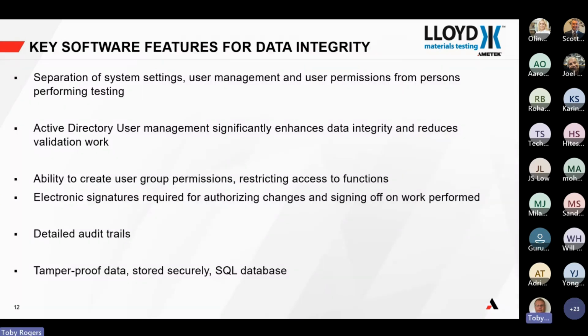So some of the key software features for data integrity. The first one is to ensure that we have separation of system settings and user management from persons performing the tests. A key part of 21 CFR Part 11 is to make sure that those people that have access to add and remove users to a system must be separated from those who actually use the system and perform tests.